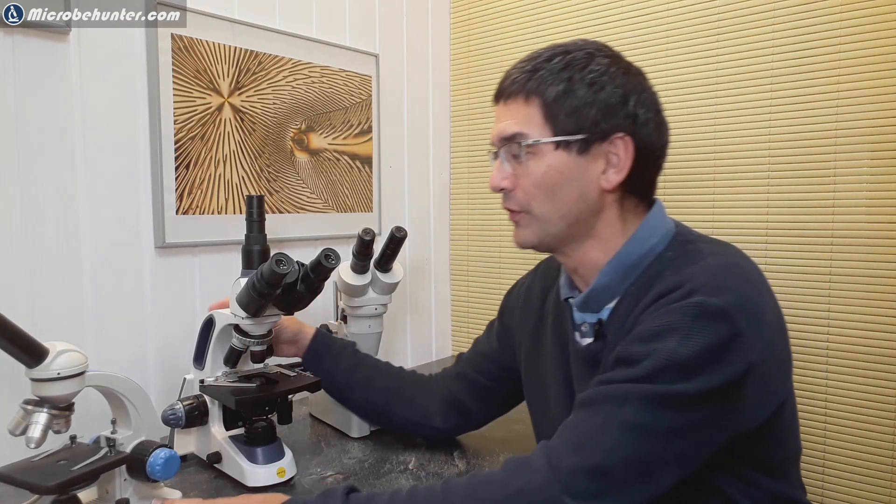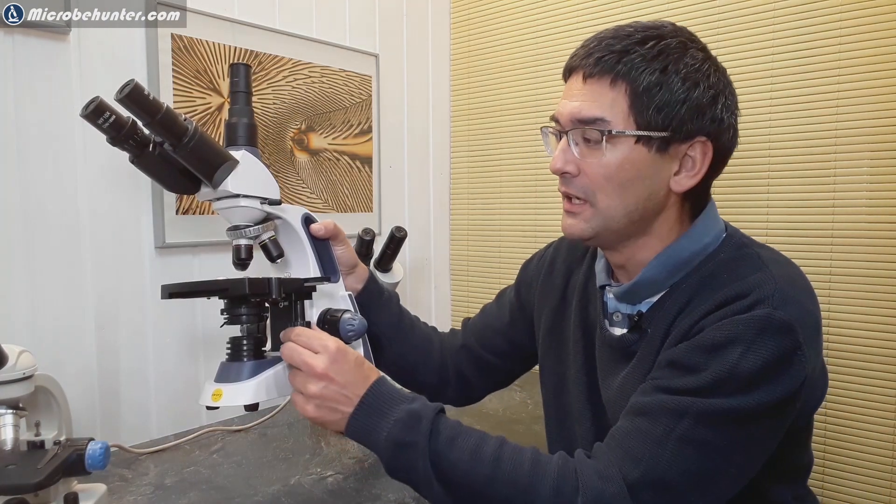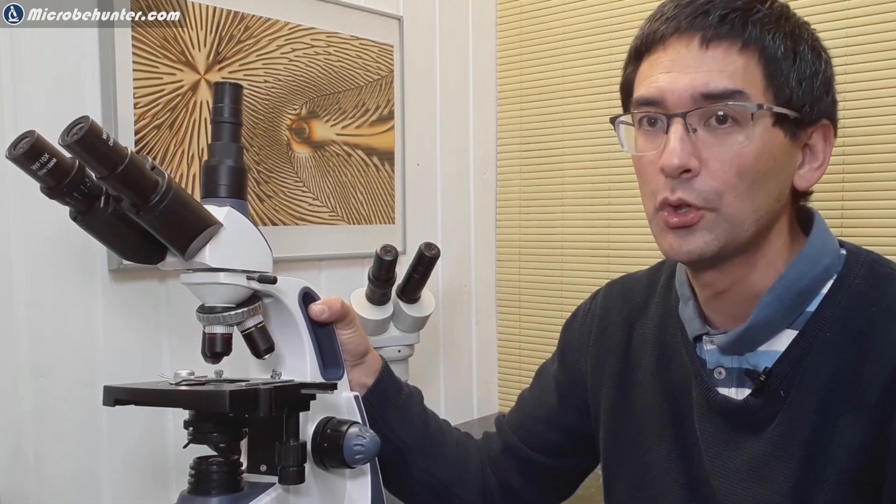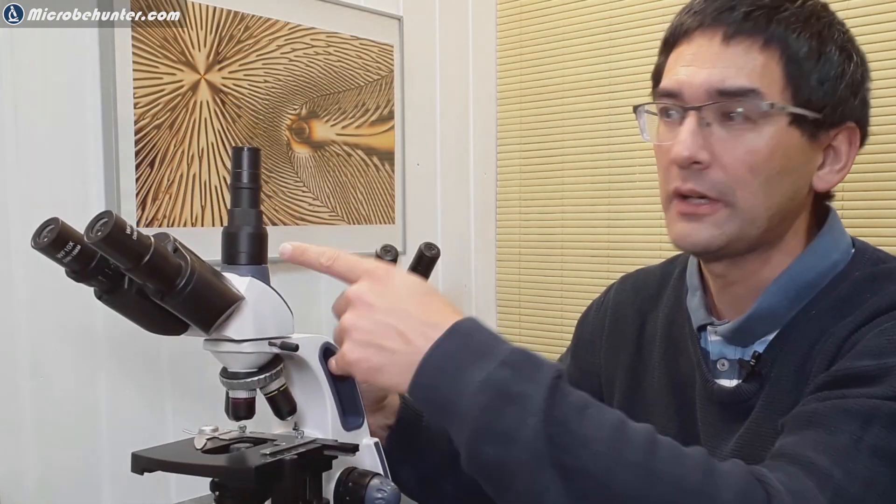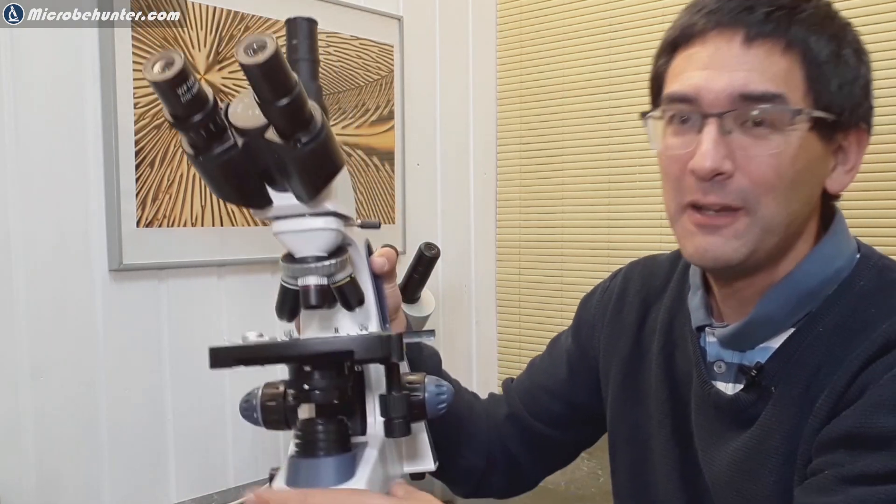If you however already have a slightly better model, I'm just going to use this one over here as an example or one that is similar, I mean it's already significantly larger as you can see. It has over here a mechanical stage, it has got four objectives also oil immersion, a trinocular head for a camera of course, and of course the aforementioned condenser with an aperture diaphragm.